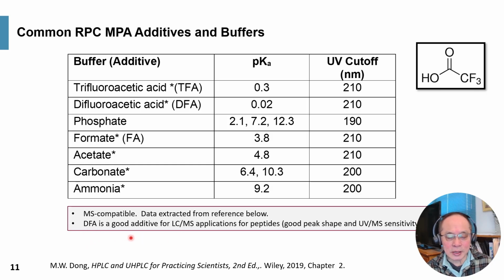So DFA is a good additive for LC mass spec application for peptides. It gives you good peak shapes and also gives you great sensitivity for both UV and in mass spec without too much ionic suppression.